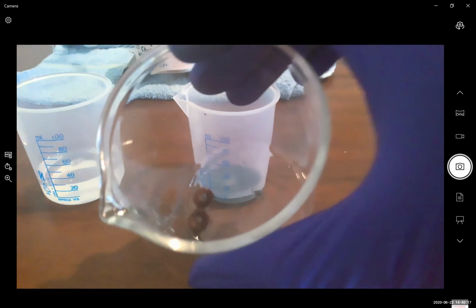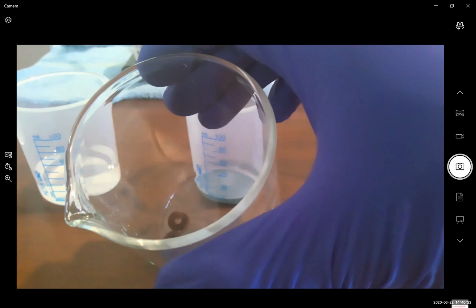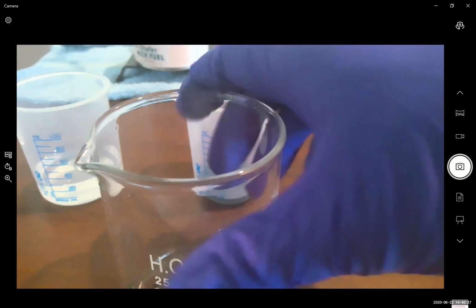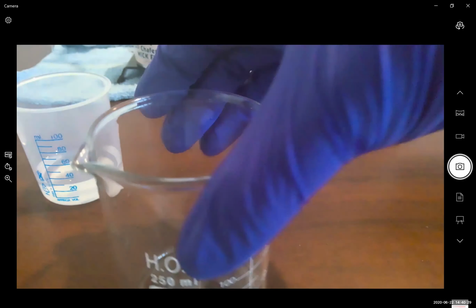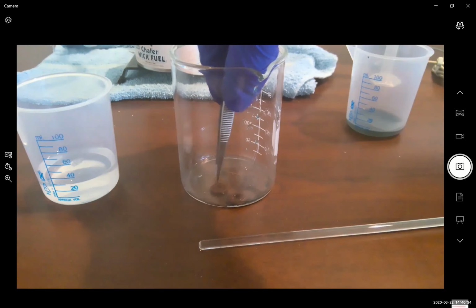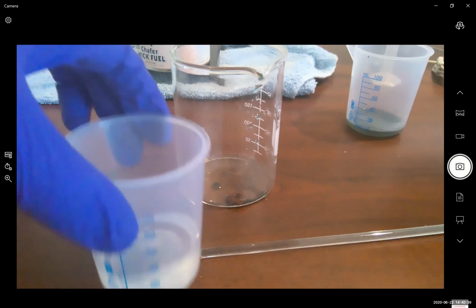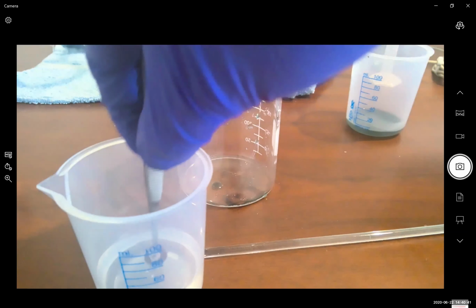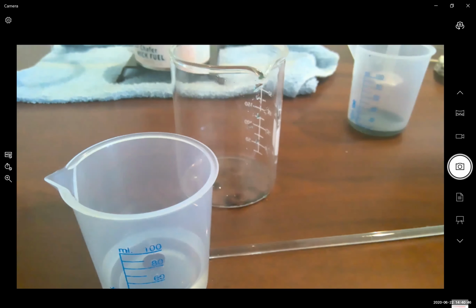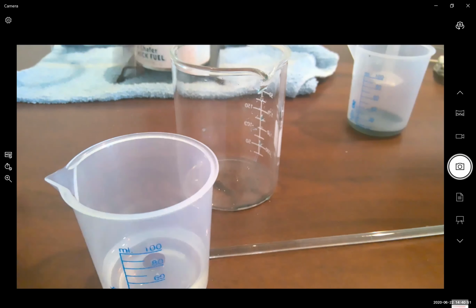So now all we have left are 2 aluminum pieces covered in copper. Now we're going to take our aluminum pieces, grab them with our forceps, and dip them and immerse them into our deionized water. This is just a rinse.